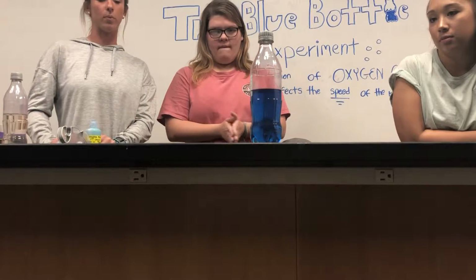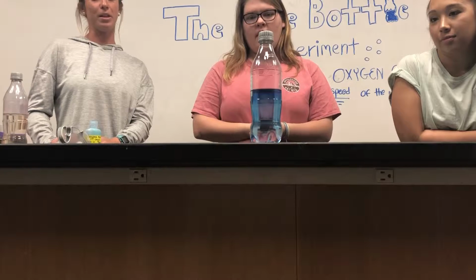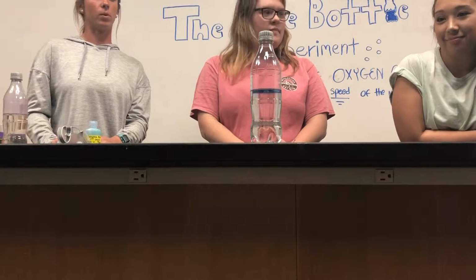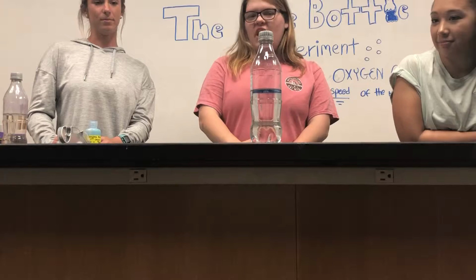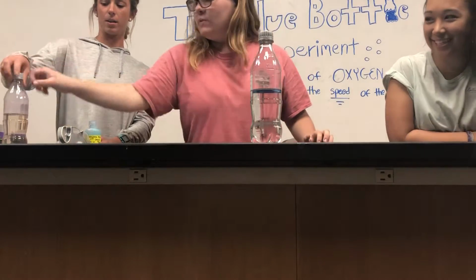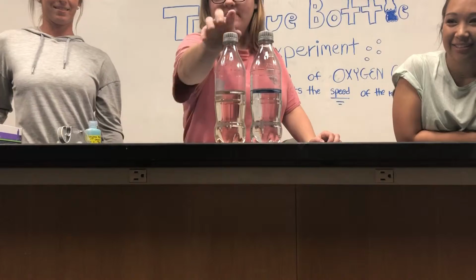You can shake it up about 20 more times and the concentration's still going to stay blue. Once you hit that probably 30 mark, it's not going to turn as dark of a blue anymore, but it is reusable in the experiment to test it. And you'll know it's about done reacting when it turns this really ugly yellow color and it just won't turn blue anymore. Like this one here. So as you can see the difference, that one's about done for.